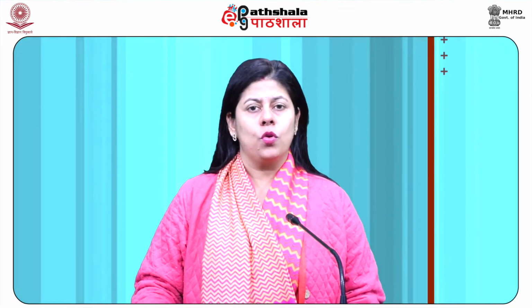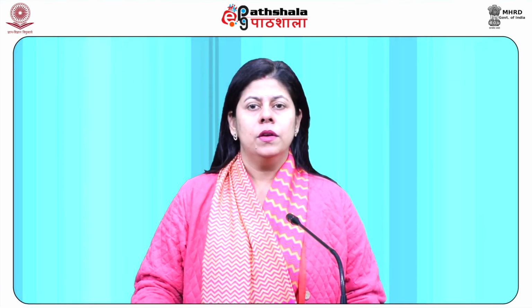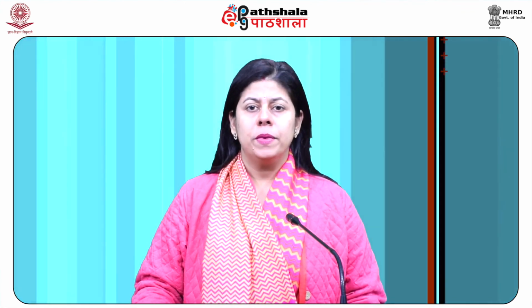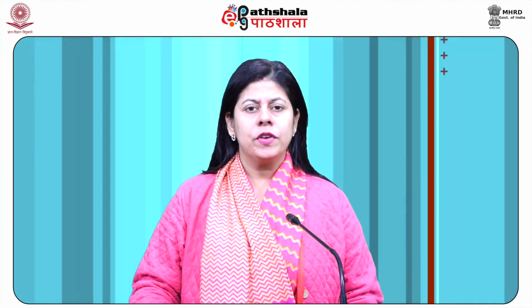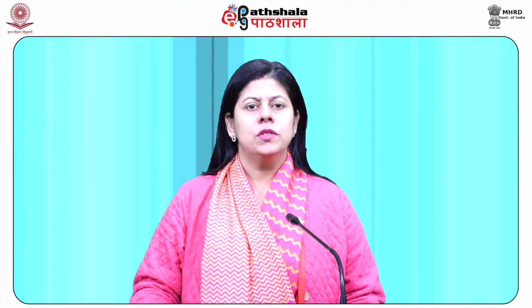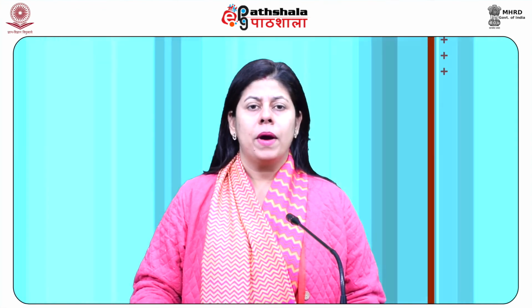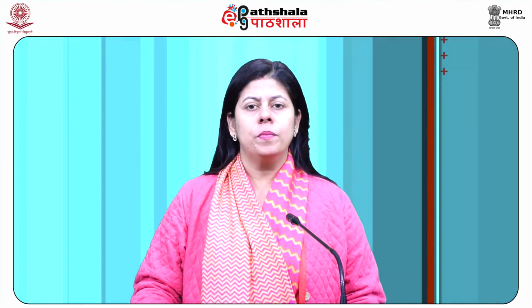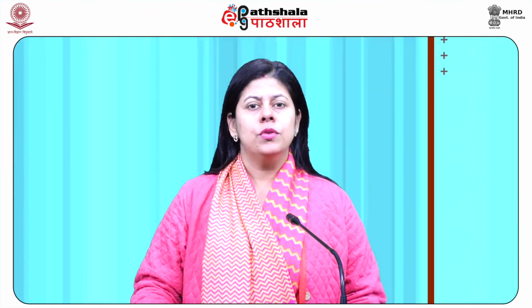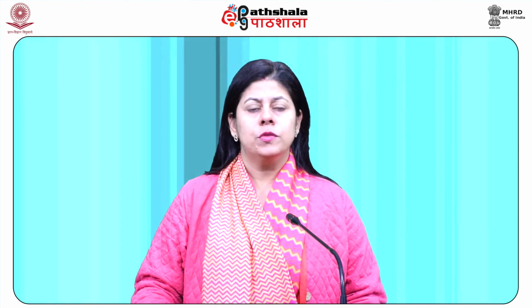The word microscope is derived from the Greek word micros, which means small, and scopion, which means to look at, and the science of exploring small objects applying such an apparatus is known as microscopy. A microscope is defined as an optical apparatus that uses an arrangement of lenses to yield an enlarged image of small objects.